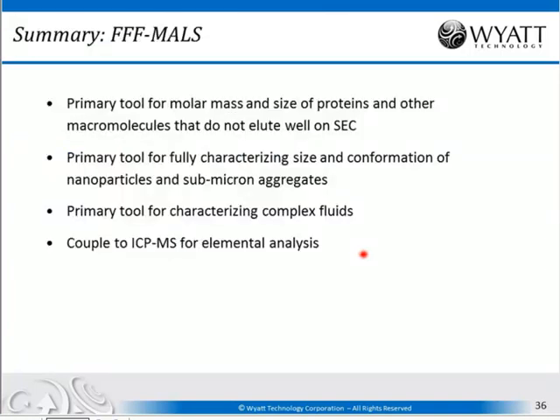To summarize, FFF-MALS is your primary tool for molar mass and size of proteins and other macromolecules, or combinations of macromolecules and nanoparticles that aren't separated well on SEC. You can look at submicron aggregates as well, and characterize these complex fluids. It's also possible to couple FFF-MALS to ICP-MS if you need to address elemental analysis.